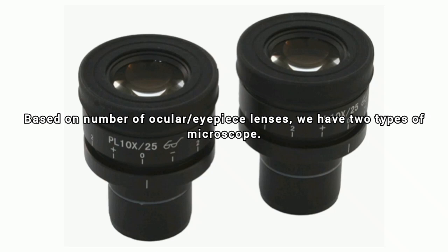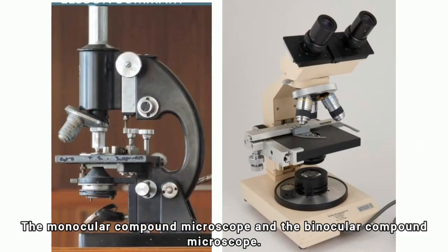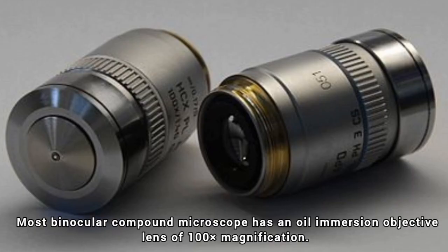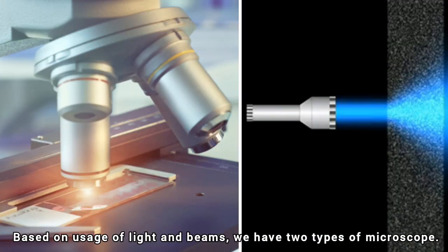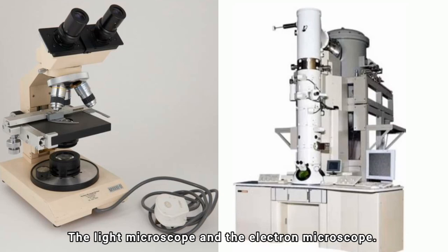Based on number of ocular or eyepiece lenses, we have two types of microscope: the monocular compound microscope and the binocular compound microscope. Most binocular compound microscopes have an oil immersion objective lens of 100 times magnification. Based on usage of lights and beams, we have two types of microscope: the light microscope and the electron microscope.